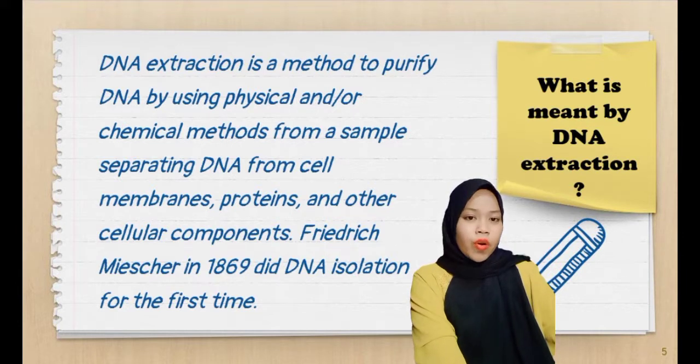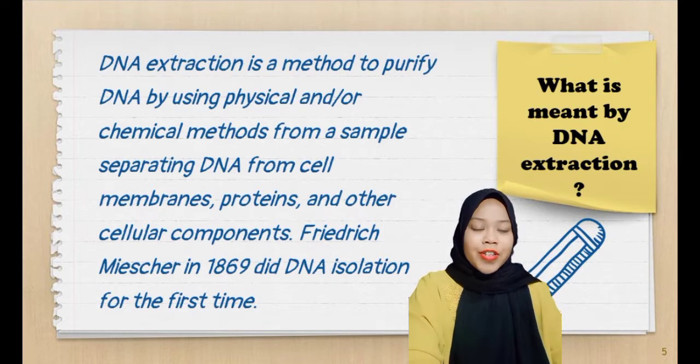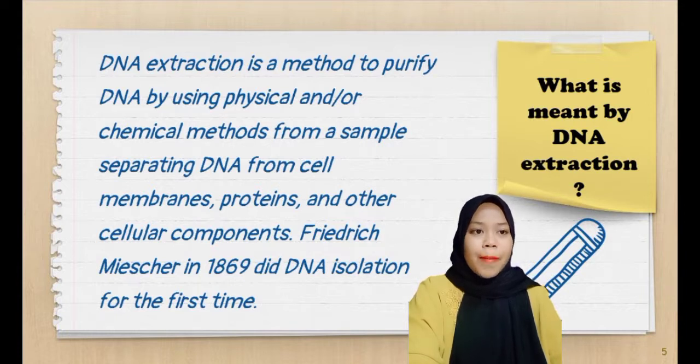Today I'm going to talk about DNA extraction. For information, DNA extraction is a method to purify DNA by using physical and/or chemical methods from a sample, separating DNA from cell membranes, proteins, and other cellular components.